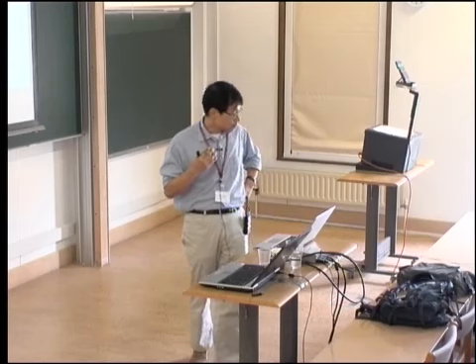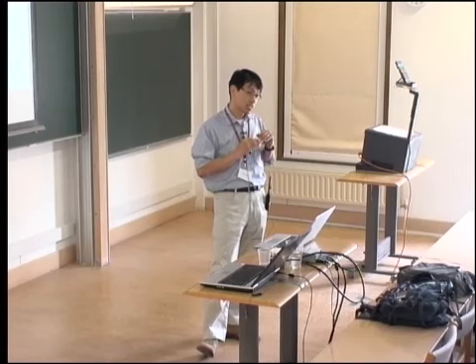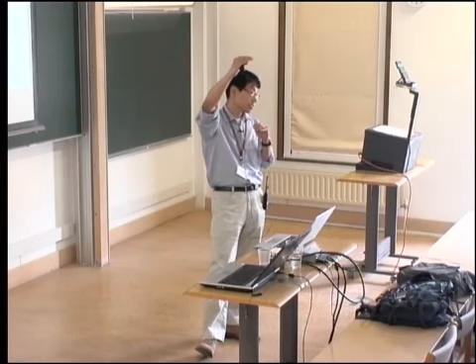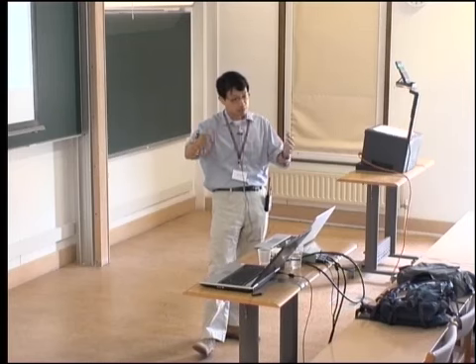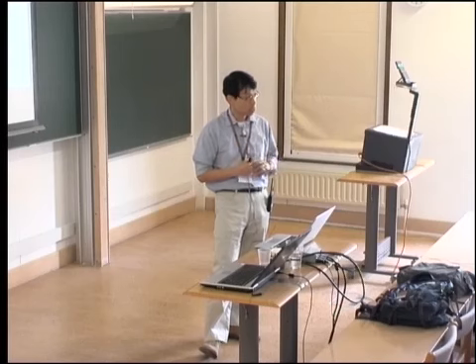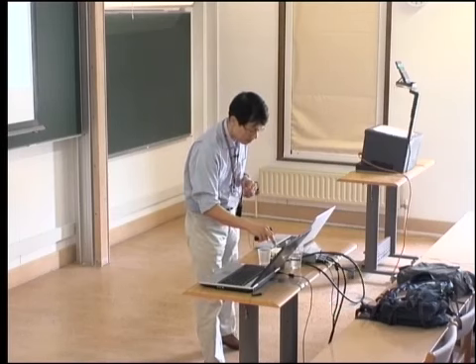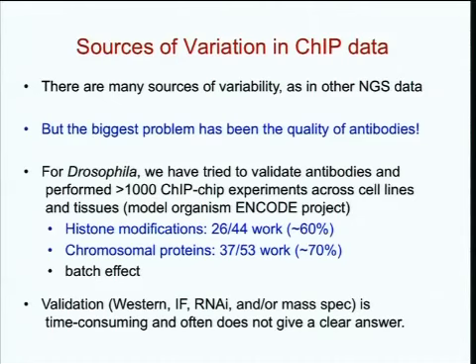So we have a model where if you specify, I want all the sites with, let's say, 5-fold enrichment in my ChIP profile compared to the input, and this is how many reads we have right now, then we can predict based on some modeling how many reads you might need. Now, so that's all I'm going to say about the actual method, other than the peak calling for the broad regions that I'm going to talk about in the second half.